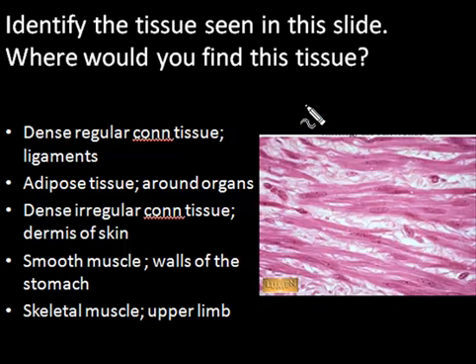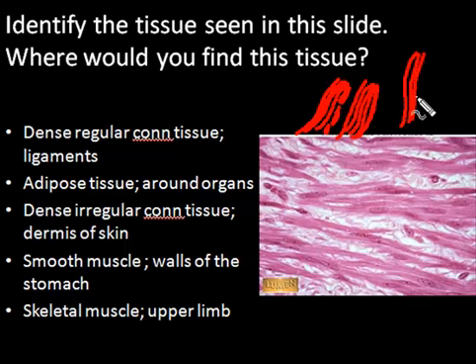If this was connective tissue, like we know this is not cartilage, it's not blood. So the only kind of connective tissue you could confuse this with is either dense regular or dense irregular. You would think more irregular because of all these spaces in between. But anyway, in dense connective tissue, you have these collagen bundles, which if it was dense regular, they would all lie along the same direction. And then the fibroblast nuclei get caught in between the collagen bundles. So again, if it was like this, you get the fibroblast nuclei caught in between. So it is not dense connective tissue.